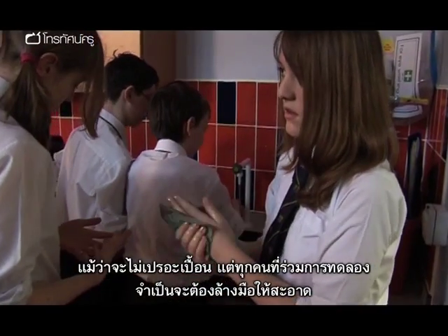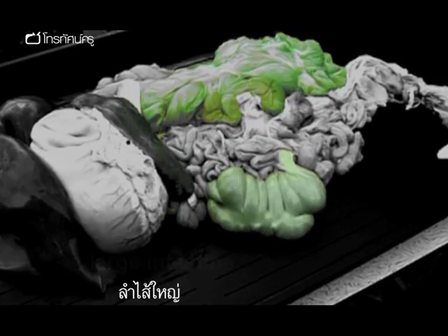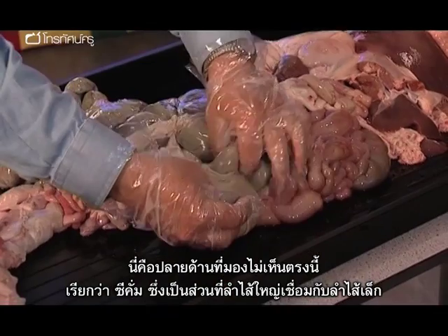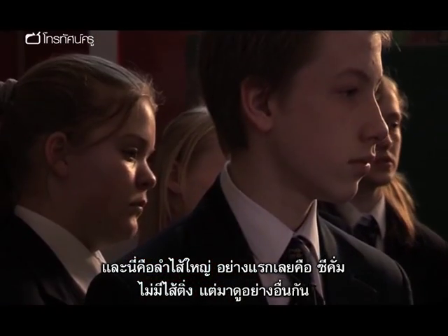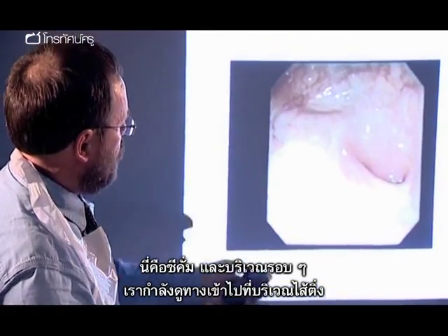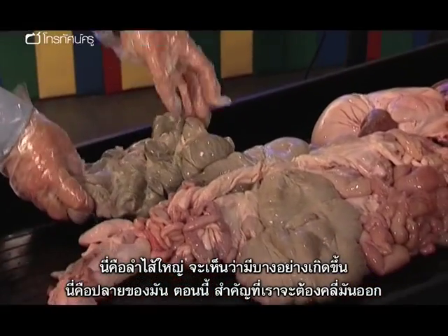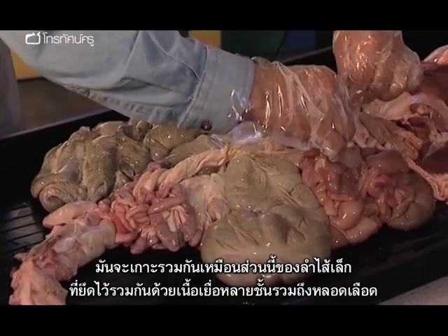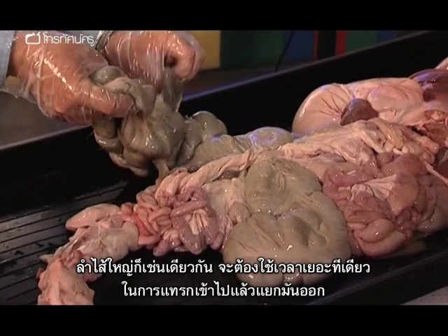Even without a spillage, it's essential that everyone involved washes their hands thoroughly. "We've got a blind-ending section just here, which is the cecum. This is the point at which the small intestine joins into it. So we've got the large intestine — the cecum first of all. No appendix, but let's look at the entrance to the appendix just there. And then we're into the large intestine."